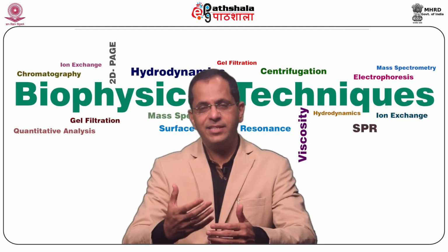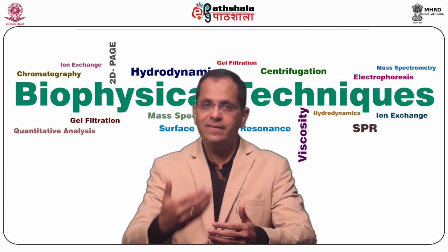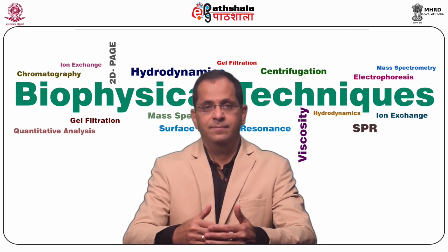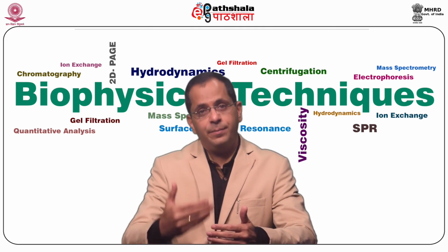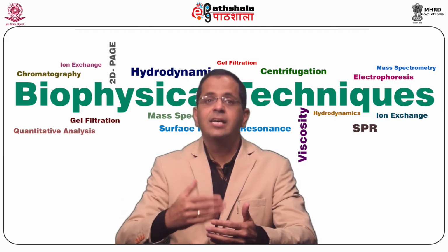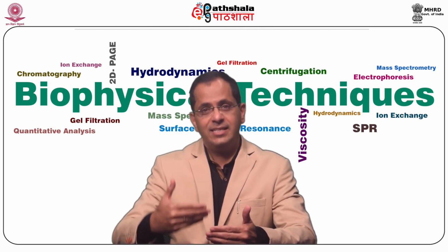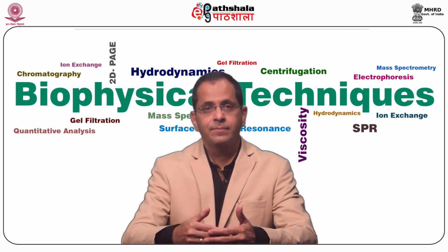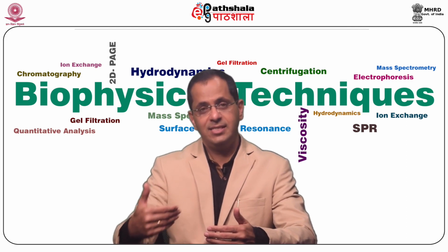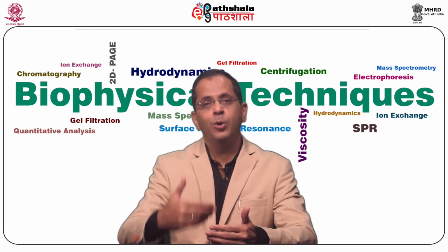Advantages and disadvantages of gel-free proteomics. First, the advantages. It has higher sensitivity. It has easier automation of the procedures involved. It has better reproducibility. It has reduced influence of intrinsic protein parameters. There is availability of sophisticated mass spectrometry machines these days. Quantitative data is statistically more robust.